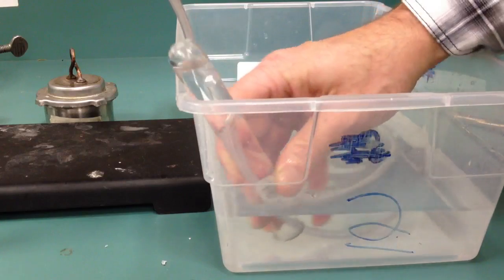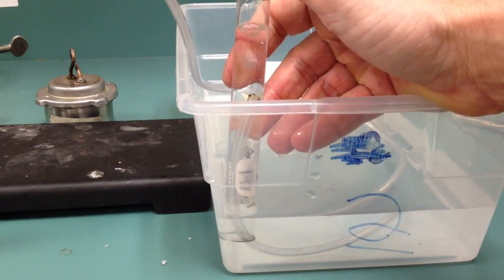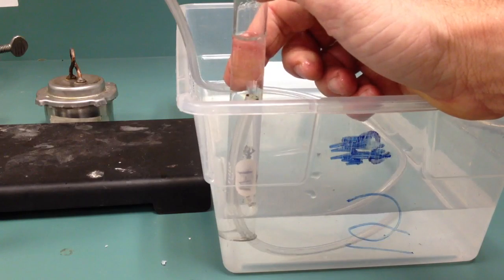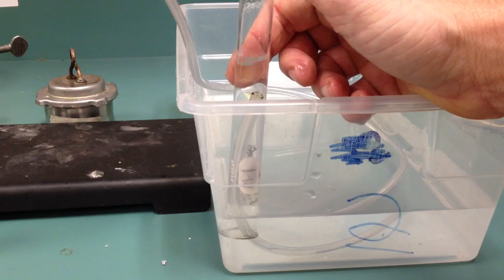So, there are certain groups that did the lab that could get a really pretty loud pop. And then, I'm not getting that dramatic of one right now. But it is the hydrogen reacting with oxygen. And you end up making water.